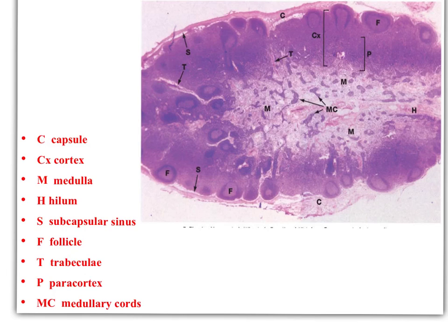The P area or the P zone, when you have a label for deep part of the cortex at its junction with the medulla, this deep part, it is the paracortex. This paracortex has another name, which is the thymus dependent zone. Why? Because it depends on the thymus to have its cellular content. What is the type of the cells here? It is the T lymphocytes.